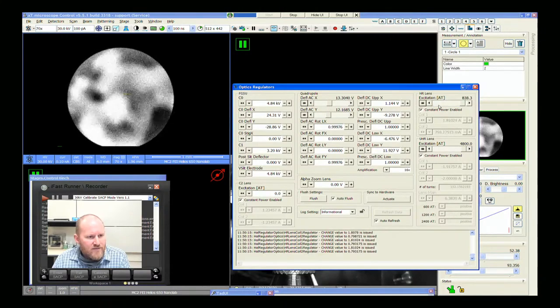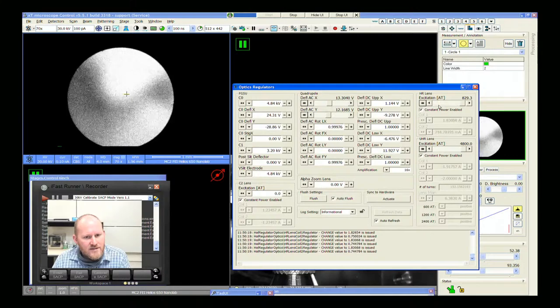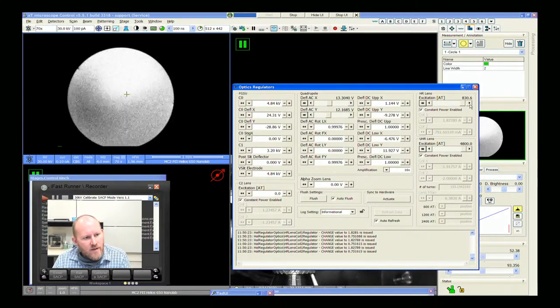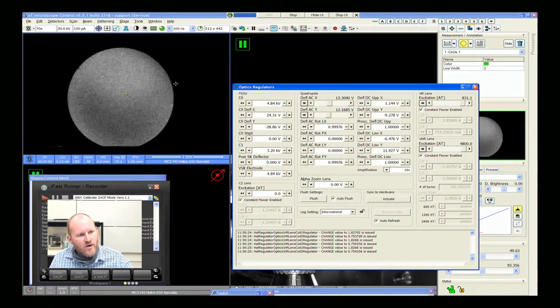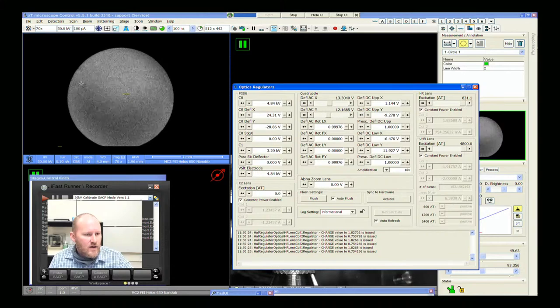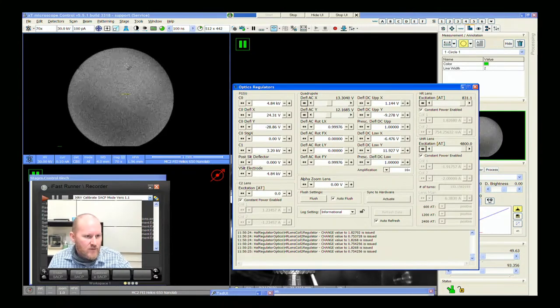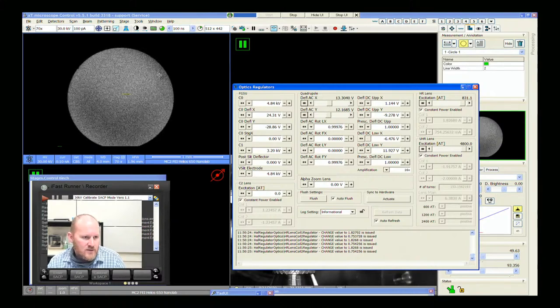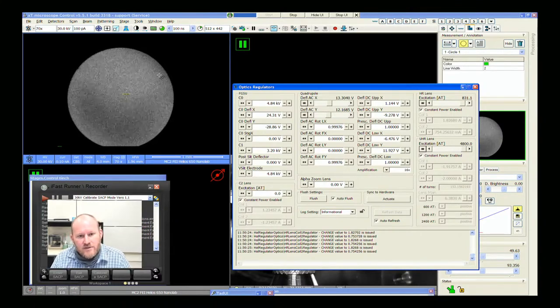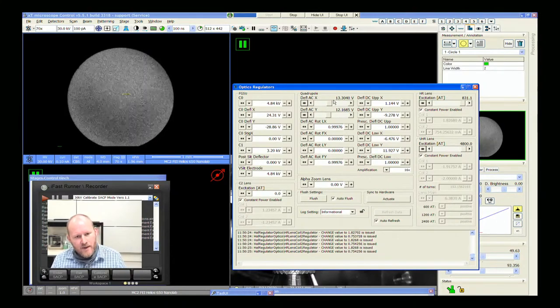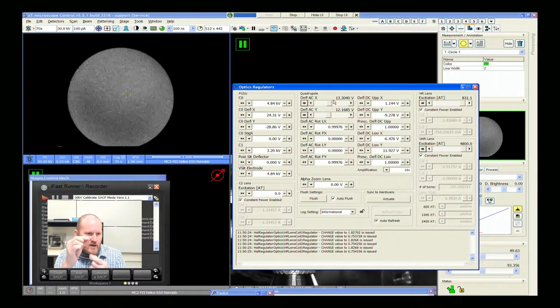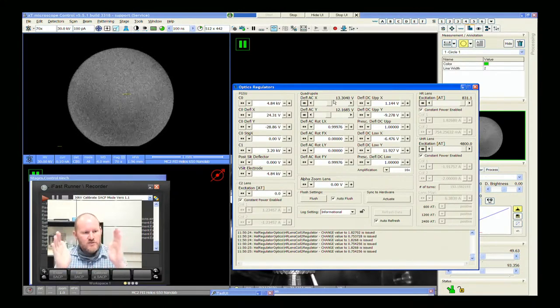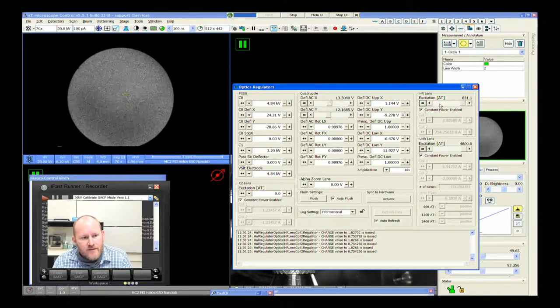What I want to do is find basically the point — here is the point that if this were a true Ronchigram, the edge is what they call the region of infinite azimuth magnification. We would have some radial stripes — that's the region of infinite radial magnification. Basically it just means that the rocking point is exactly on the sample surface. We have some chromatic aberrations in the lenses, so there's a small difference between the rocking point of the two extremes of the aberrations. That's why we can still see it.